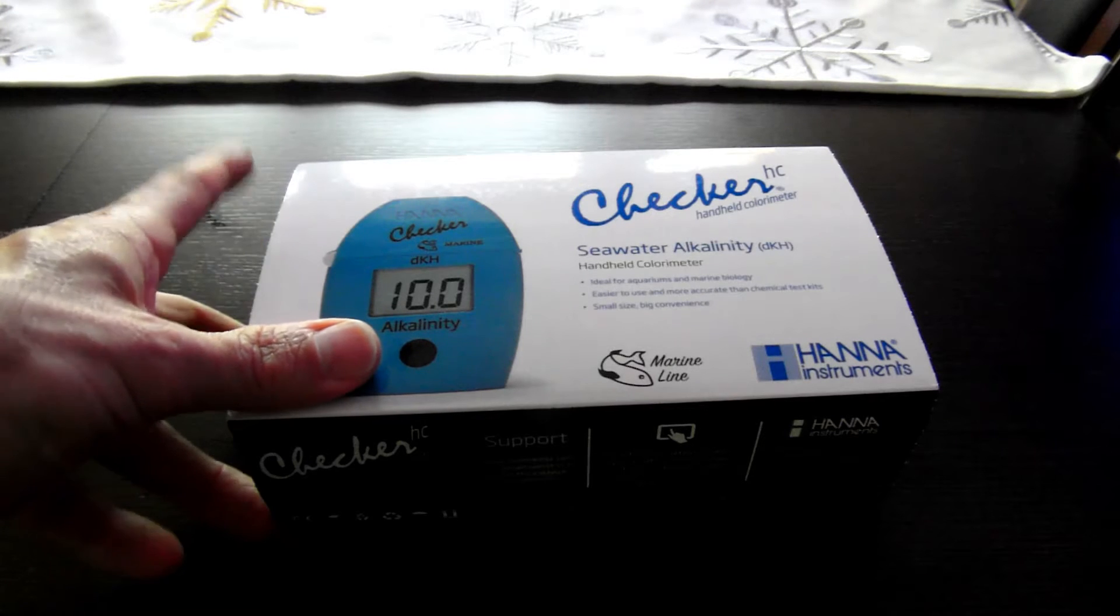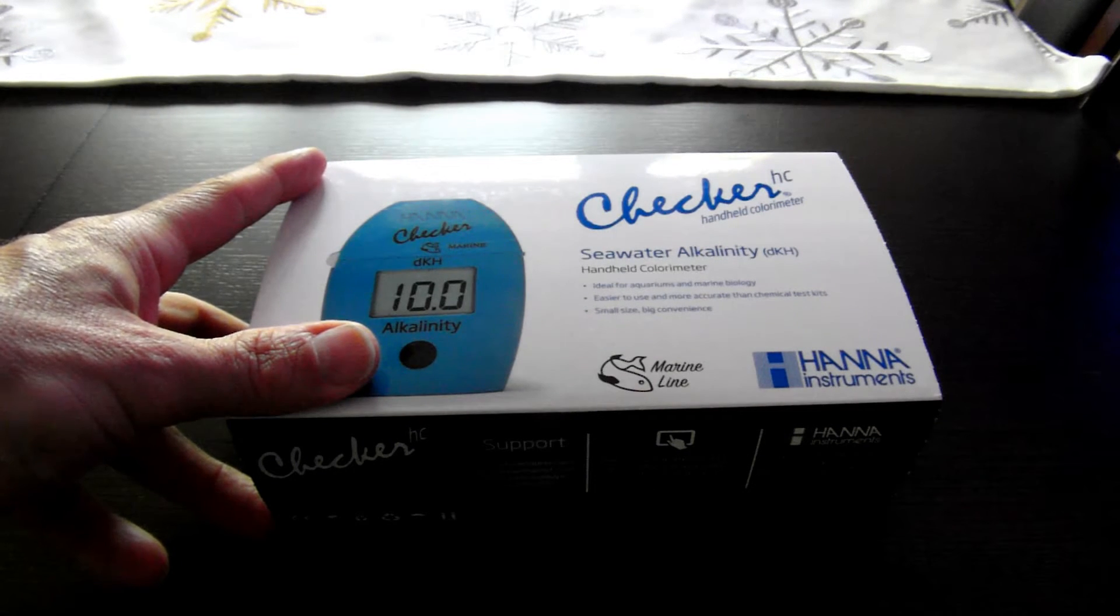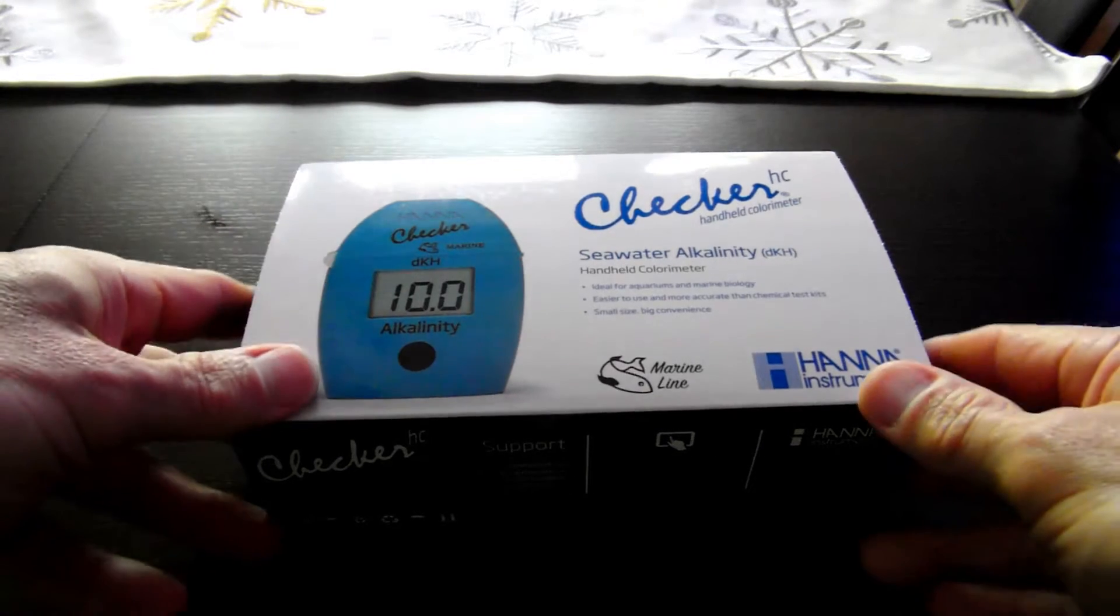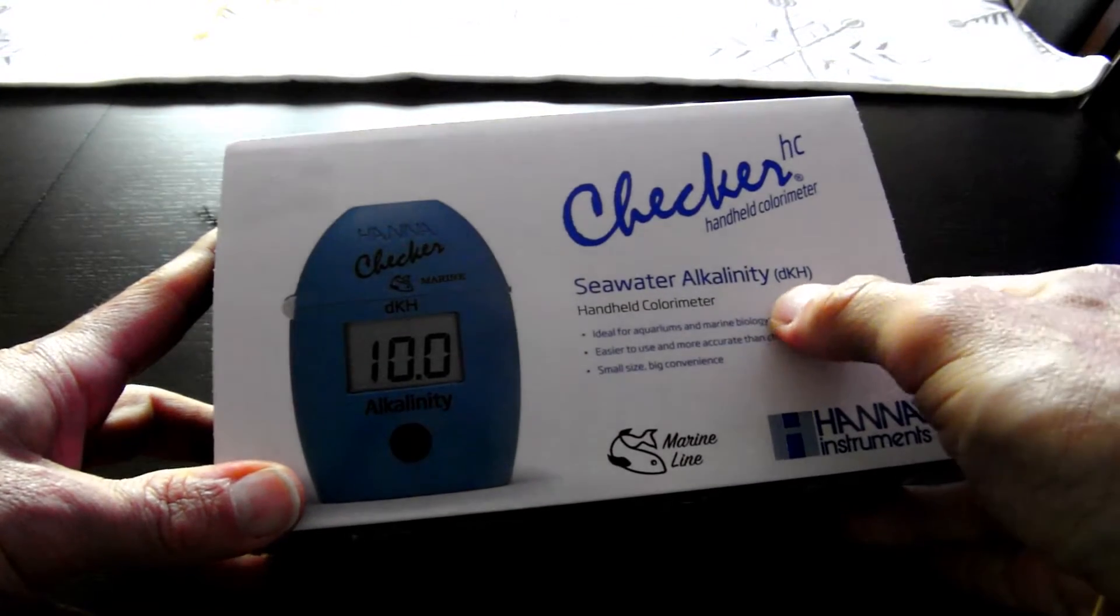I ordered from Bulk Reef Supply. I'm really happy with them as a supplier and find their helpful videos to be very informative and educational. This version of the Hanna Checker for alkalinity measures in DKH, German Degrees of Hardness.